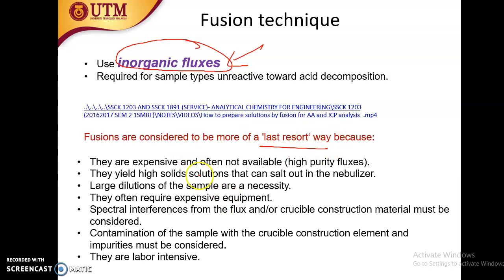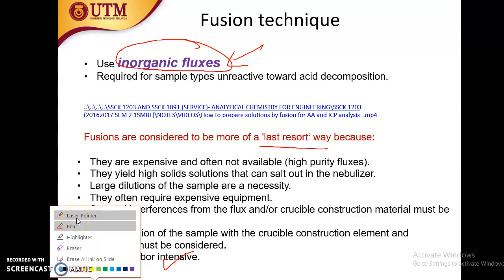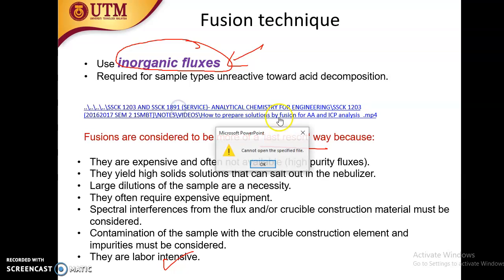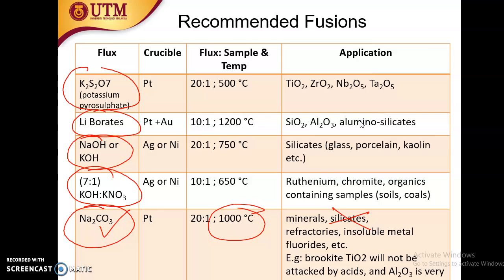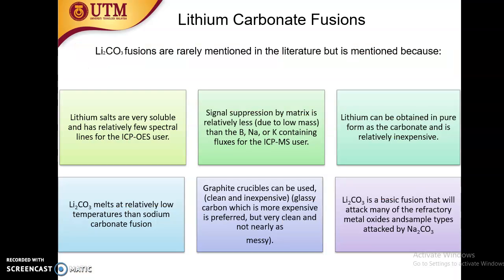They are also labor intensive because we have to wait for it. Let me see if I have the video. Cannot open. Okay, I don't have the video, but never mind, you can find it in YouTube. You can find how to prepare solution by fusion for AA and ICP analysis. This is an example of lithium carbonate fusion. You can read on your own.